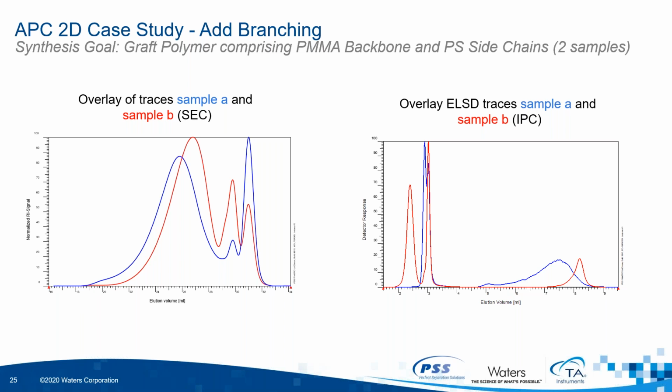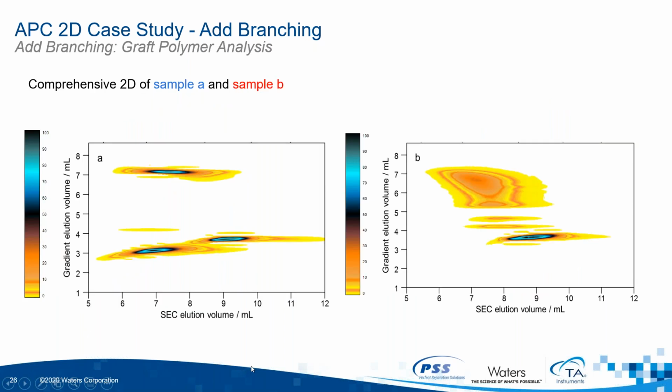Unreacted side chains or backbones could still be present. Both techniques performed by themselves yield insufficient information. But yet again, 2D analysis yields a different view of things. Not only have the peaks become more colorful, you can also see that additional peaks surfaced.